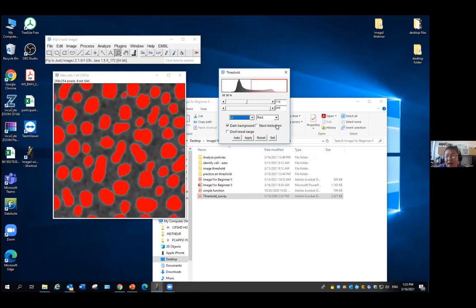As I said, I want you to use the same thresholding for all images. You should, but that depends on all your images being taken under the same condition, with similar intensity levels and similar background intensity levels. That is kind of easy to say, but hard to achieve.